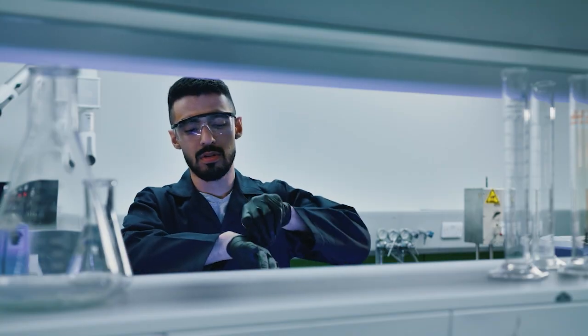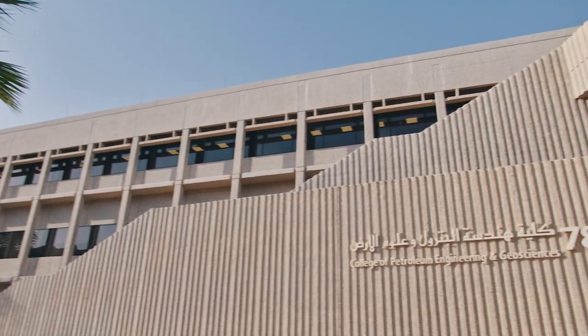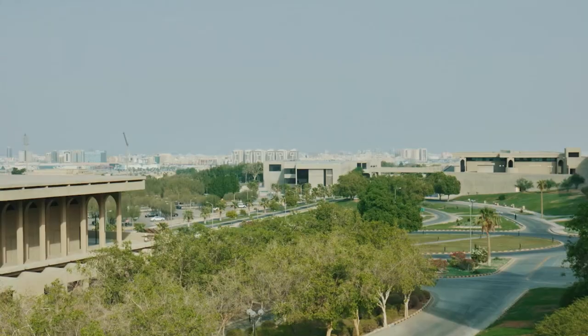Working in a laboratory is always potentially dangerous. However, you should not be afraid, but work with concentration and the necessary respect for chemistry. Follow these simple laboratory rules, and you will greatly reduce the risk of hurting yourself or someone else.